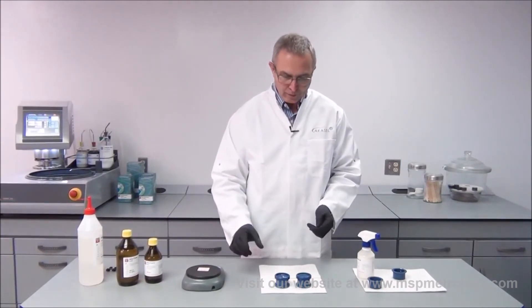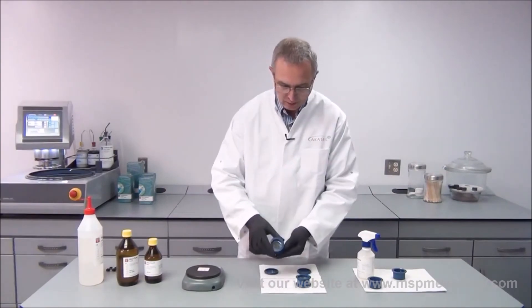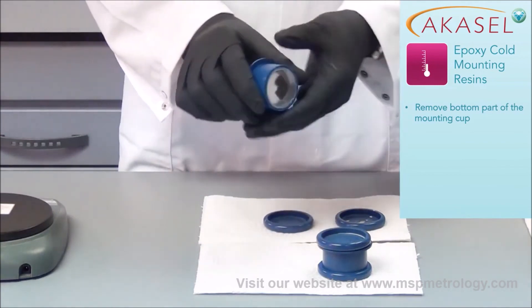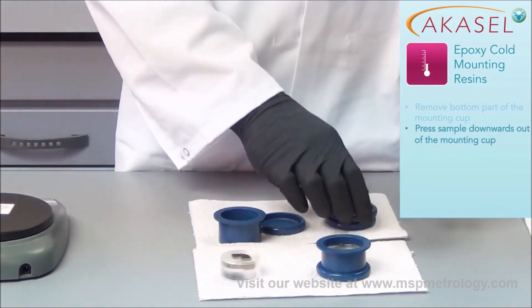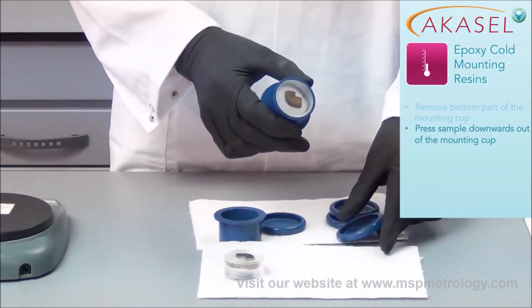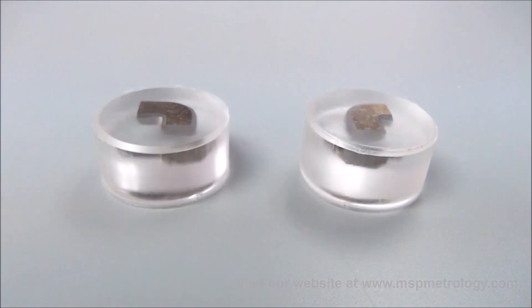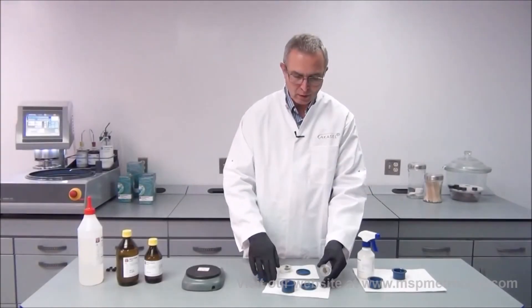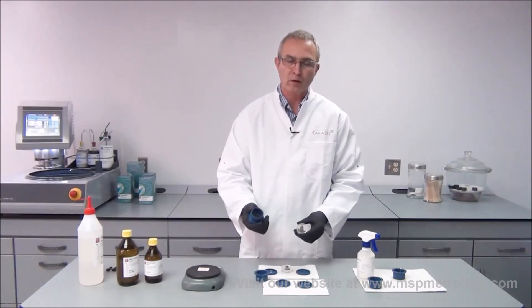Now I'm ready to remove my mounts from the mounting cups. I check if they are cured — yes, they are cured perfectly with no sticky surface at all. I remove the bottom of the mounting cup and press the mount out downwards, because the top of the mounting cup is slightly tapered so it can only be removed this way. You can see there is a small bevel at the bottom, which makes grinding and polishing easier afterwards so we don't rip our consumables. The samples are easy to remove only because I used the AkaGnostic spray beforehand.